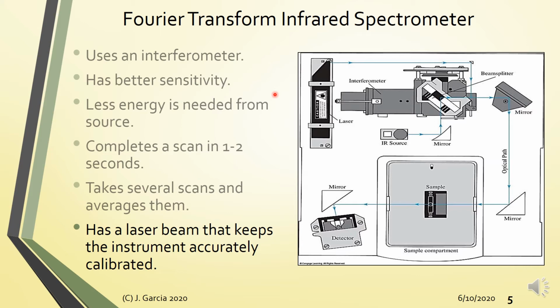Mag-run ka ng blank na water, i-run mo siya as background. So basically gagawin ng instrument, i-cancel na yung reading ng water. Kaso since very strong ang reading ng water ng background mo, pag nilagay mo yung sample mo na may analyte dissolved in water, water pa rin yung mababasa ng instrument. Alright, so no ang water. Okay, water and carbon dioxide.